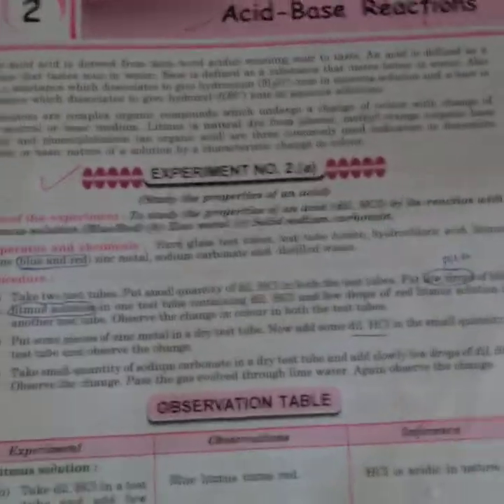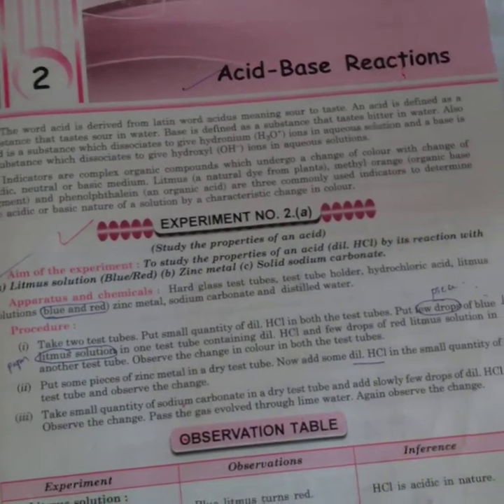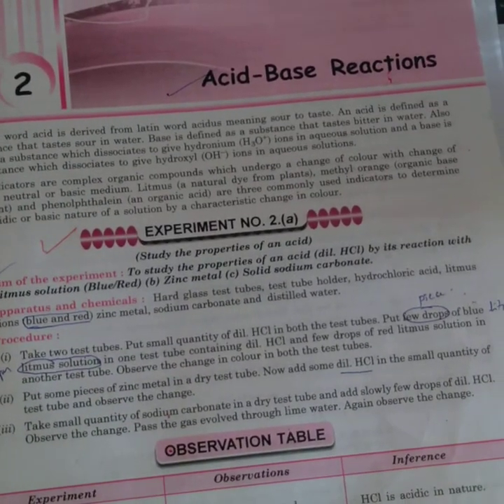So directly we'll go one by one. This is the observation table. This is very important, children. I already gave you this table in the WhatsApp group. You are supposed to write this table on a white page.